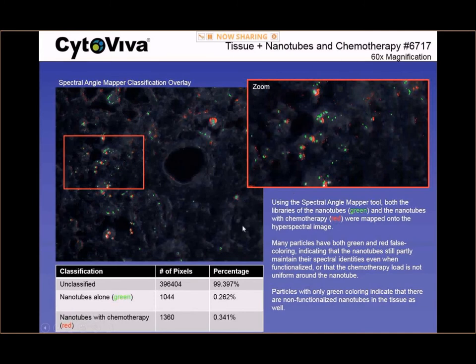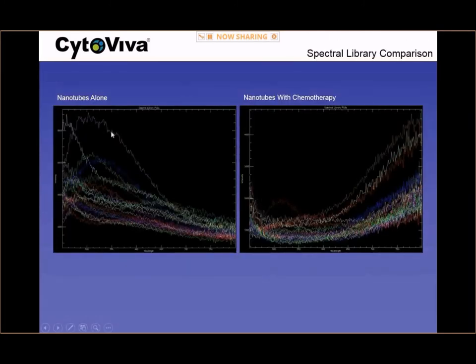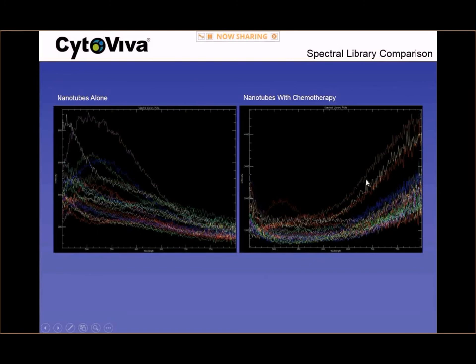This research group was able to prove using this technique that carbon nanotubes with chemotherapy localized in very specific areas of the tissue and the chemotherapy was there and being released from the carbon nanotubes. This is a very significant dataset and very helpful in pharmacokinetic studies related to nano-drug delivery. The spectral library shows that nanotubes alone produce a distinctly different spectral response when normalized compared to nanotubes with the chemotherapy, showing how dramatically different the chemotherapy affects the nanotube spectrum.